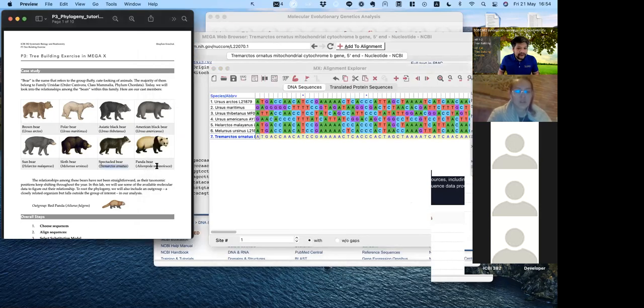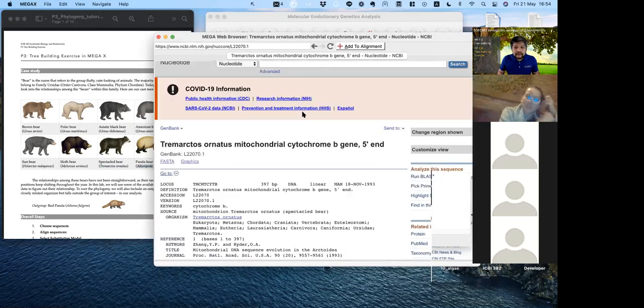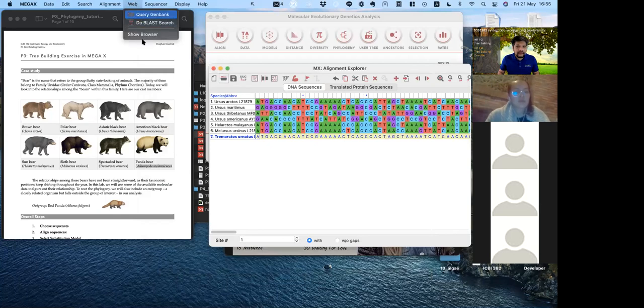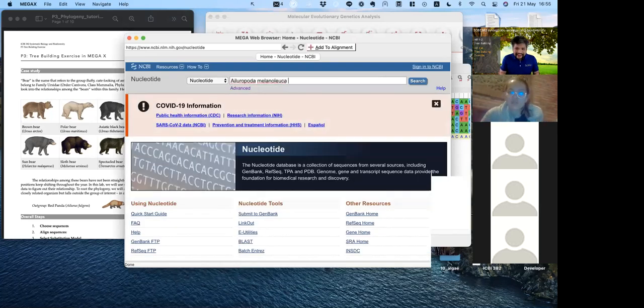Okay, almost there. I'm on the last one here. I think this is probably the slowest you can get. You guys probably finished way before me.